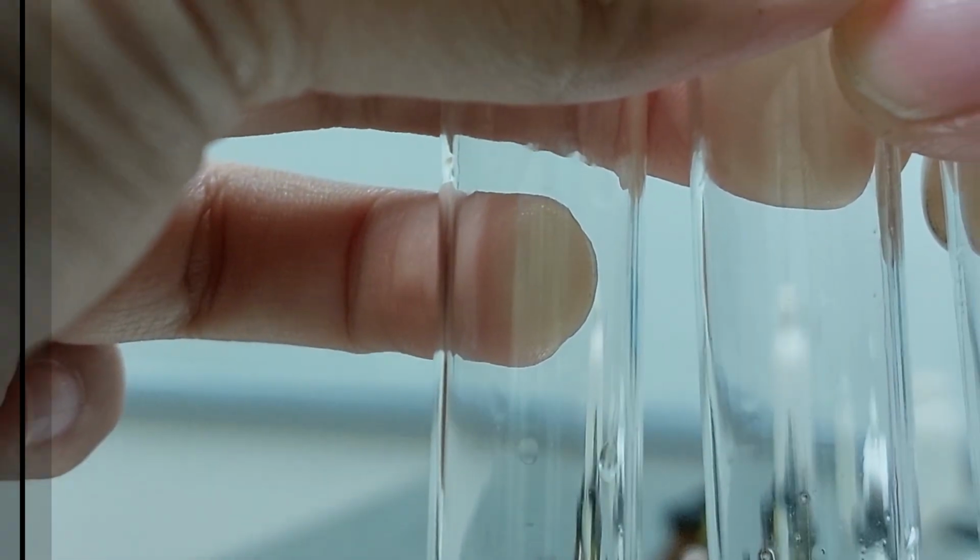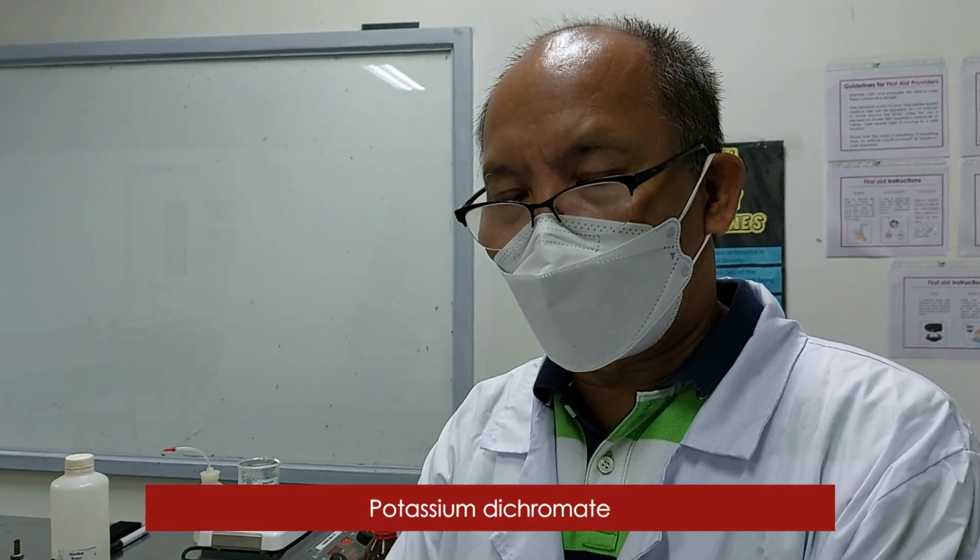So that's it. The first test for alcohol is its reaction with Lucas reagent to form alkyl halide. Now, the second type of qualitative test for alcohol is oxidation process. In this case, we are not going to use Bayer's test. We are going to use another strong oxidizing agent, which is potassium dichromate.